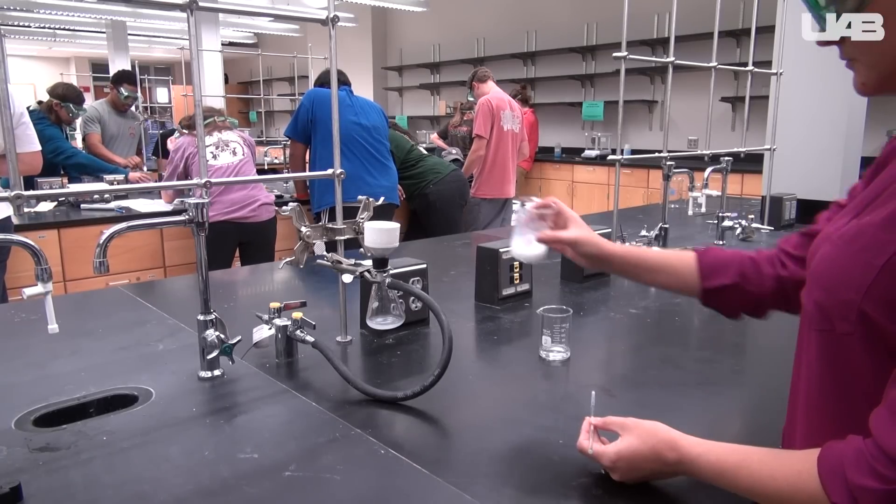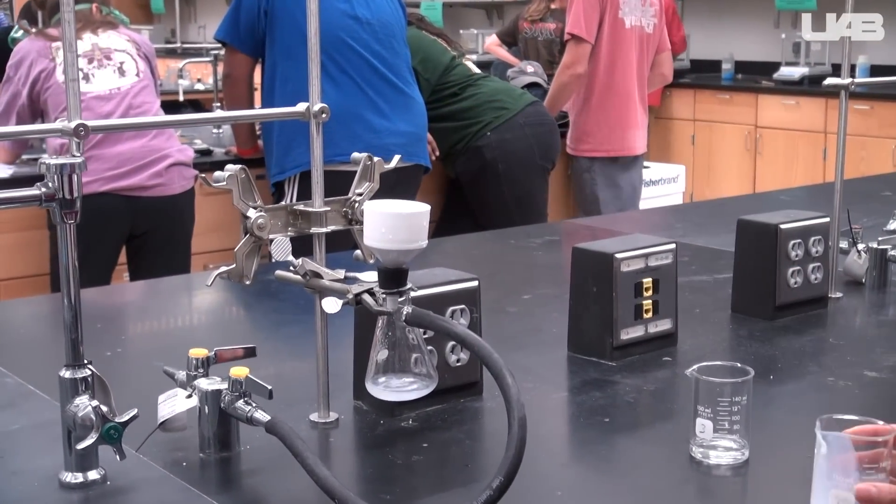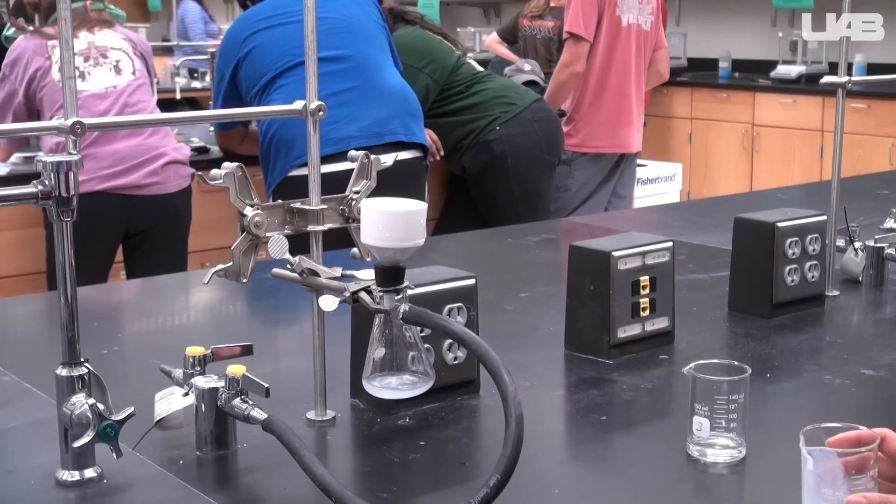Use the Buchner funnel to filter the precipitate. If you did not calculate the correct amount of ammonia, you will have a difficult time getting all of the liquid to flow through.